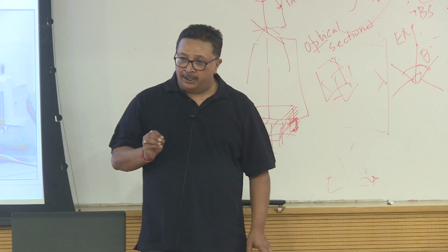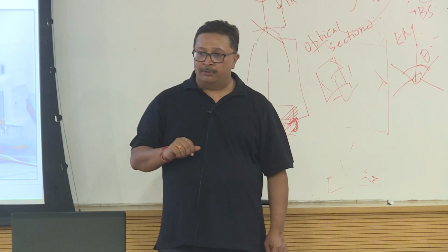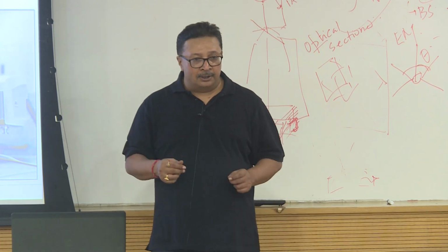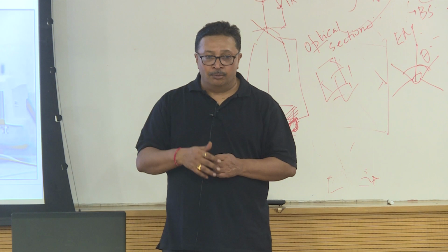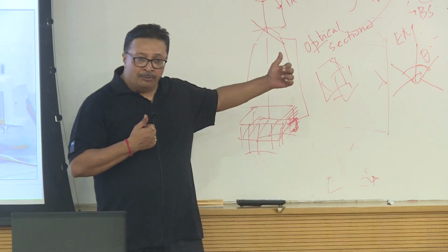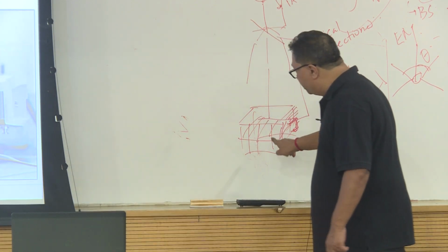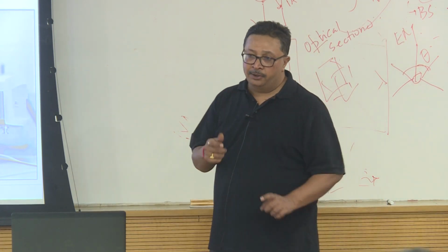Even your yeast, bacteria, fungi have 2.5 to 3 micron sample thickness. If it is a cell culture, cell line, 8 to 10 micron sample thickness. If it is a tissue, 20 micron, 30 micron, 50 micron, depending upon how well the sectioning has been done. If it is a model organism like a zebrafish embryo, it can go to 50 micron, 100 micron sample thickness. So the more depth of penetration, the more scattering, and the more optimal it is for a confocal, because the pinhole will ensure that you excite the whole volume and collect emission from the whole volume, but you are able to differentiate this single plane information from the other focal planes. And that is where the advantage of confocal comes into the picture.